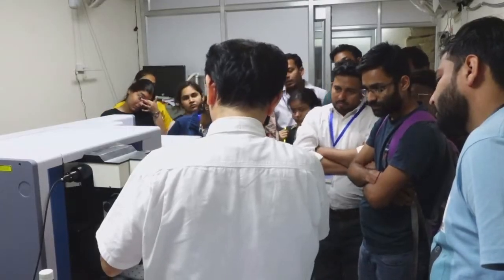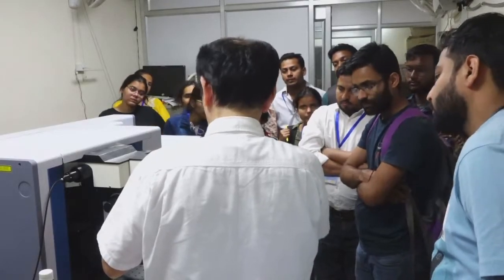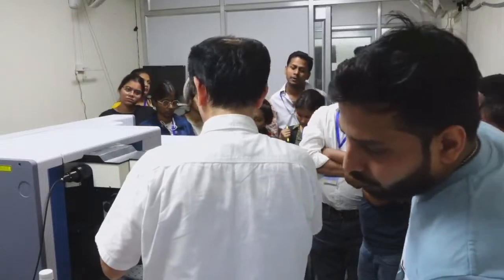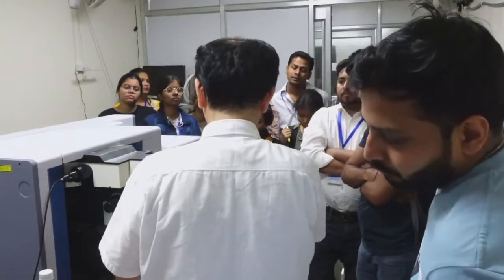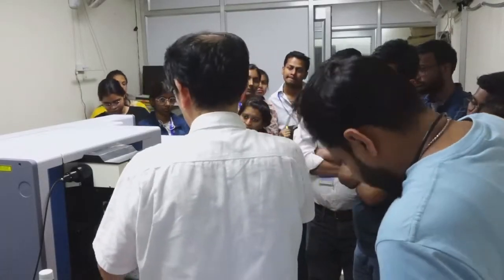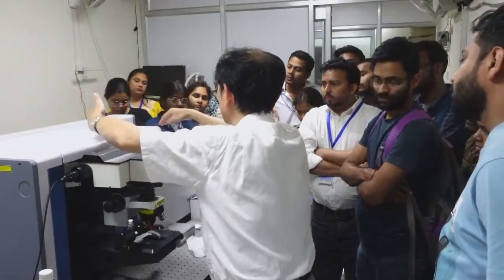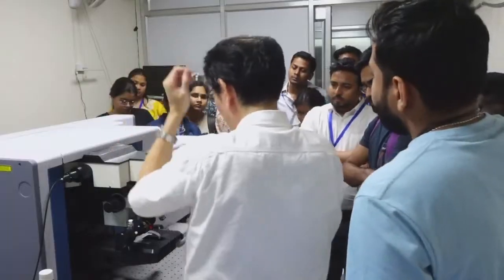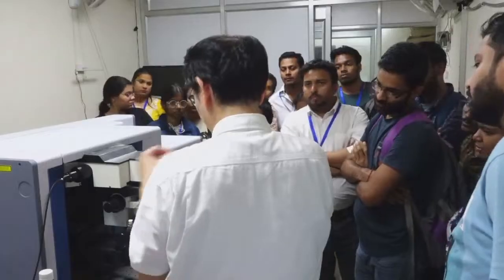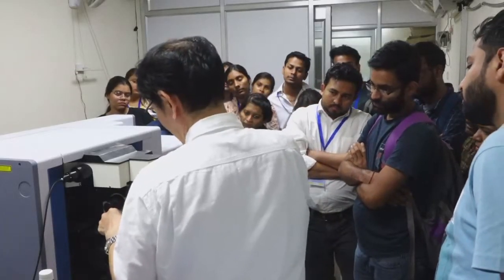It is focused on the cuvette, and the Raman scattering from the cuvette is collected. So this is also backscattering. It is collected, transferred to the dichroic mirror and transferred to the monochromator. So it facilitates measurement of liquid samples. Okay, today's sample is in a cuvette.